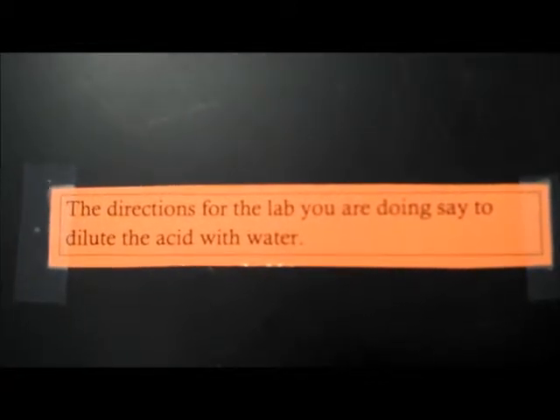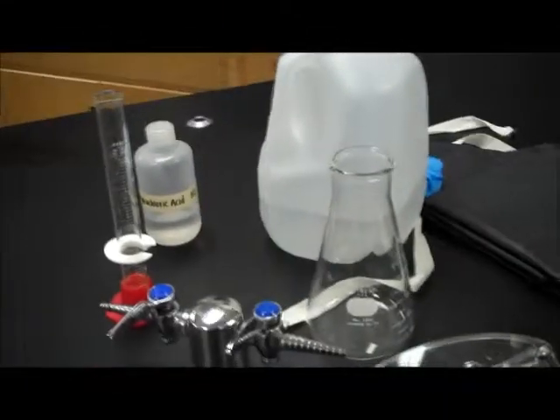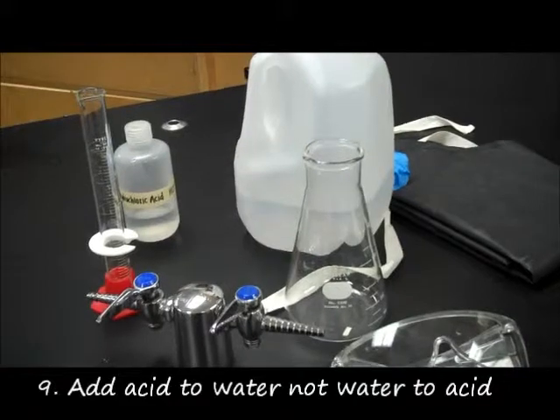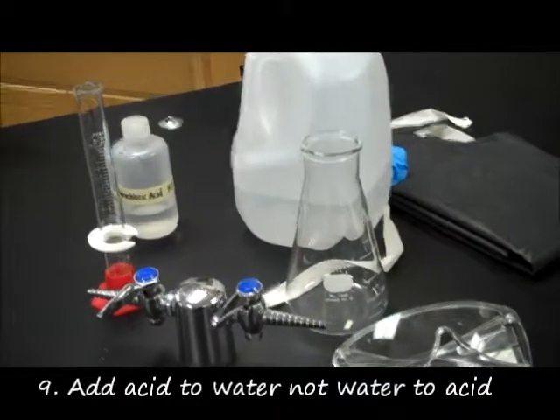For this situation, you are diluting acid with water. When you need to mix acid and water, it's very important that you do not pour the water into the acid. You should always pour the acid into the water. You can remember this by the saying, add acid. Both of them start with an A.